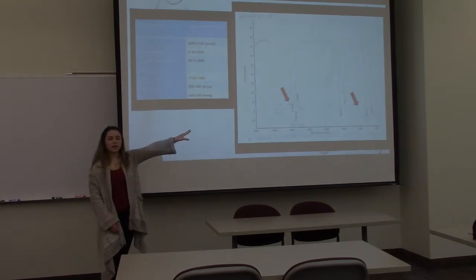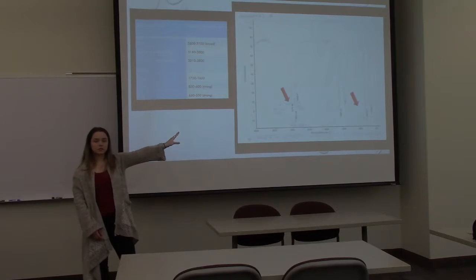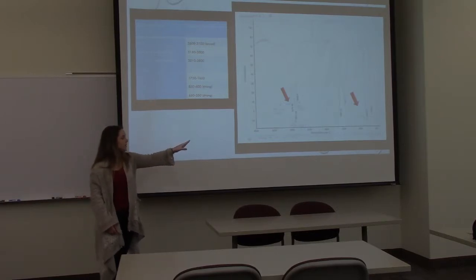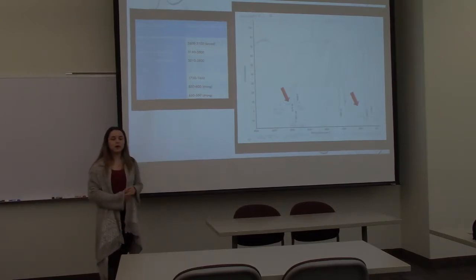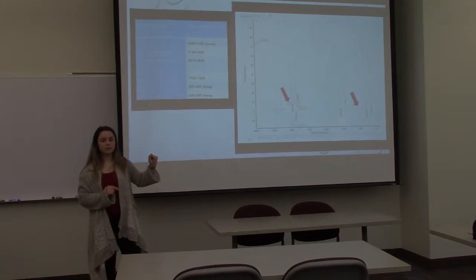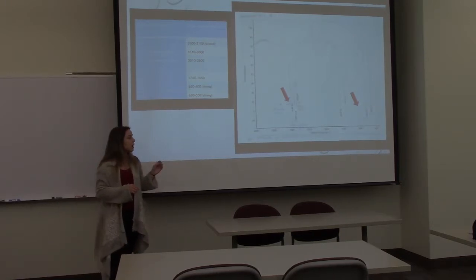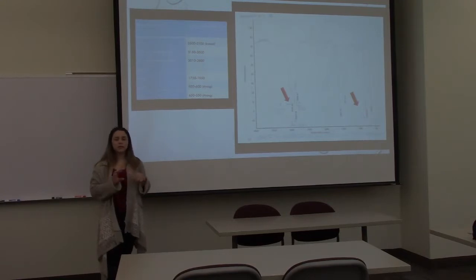So this one with the arrow closest to your left represents a CH, or carbon hydrogen benzene ring, and there's also 2 peaks that indicate a carbon hydrogen single bond, and then one all the way to your right indicating a carbon chloride functional group. The carbon chloride functional group is a little bit iffy because it's so low on the graph that it's hard to be accurate.